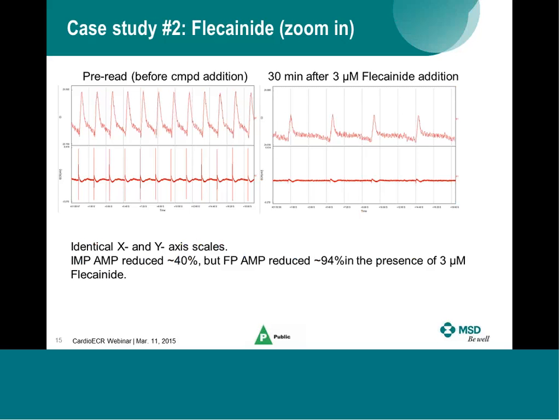So from this case study, we learned that if only based on impedance signal, the test compound effect, mainly say on the sodium channel, will be underestimated.